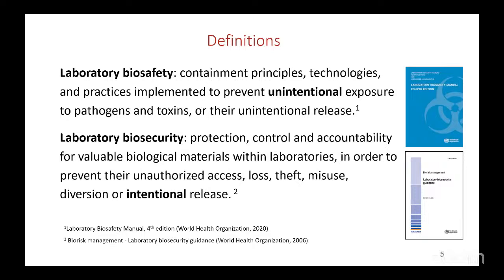On the other hand, biosecurity has to do with protection, control, and accountability of valuable biological materials within the laboratory in order to prevent their unauthorized access, loss, theft, misuse, diversion or intentional release. I don't know if you get it.